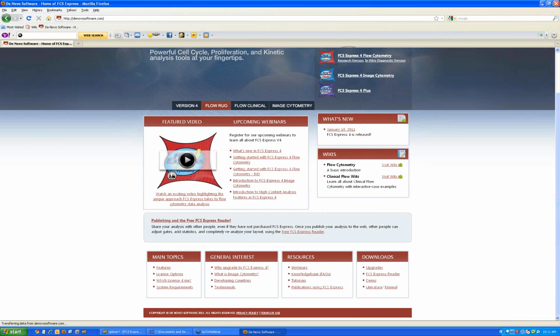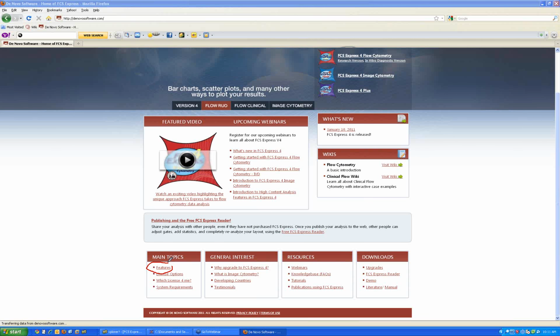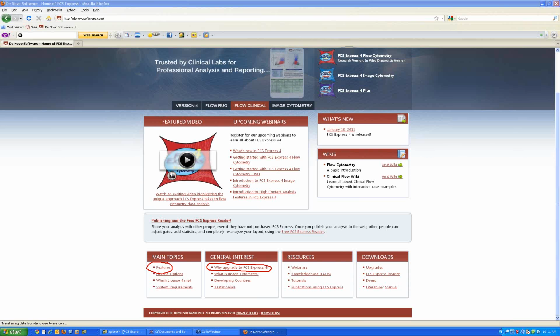Right down over here are our features. So that gives a full list of the features. We have why upgrade to FCS Express 4. That's also very useful. It has a sort of bullet list with links to more information about most things that I'm showing in the webinar today.